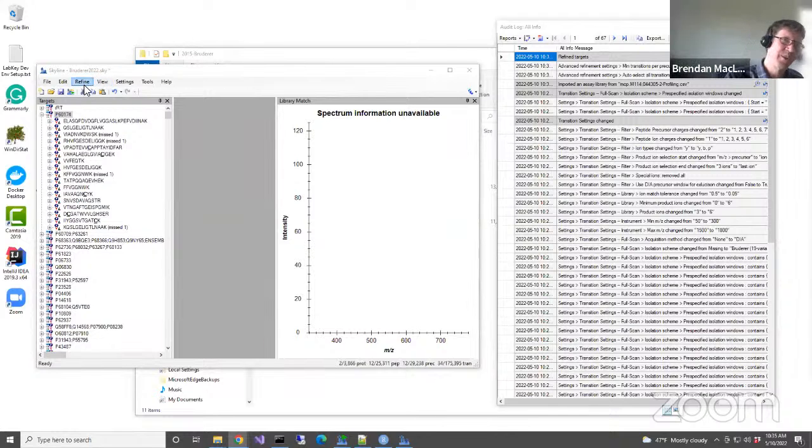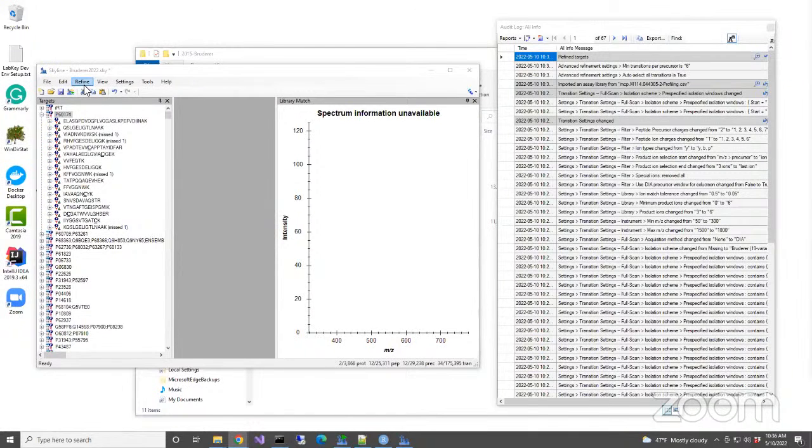Yeah, so Spectra. Hopefully tomorrow we'll go through a case where we actually build the spectral library inside Skyline. This is a case where we're going back to a paper. Ever since I started Skyline, I've been very interested in supporting both starting from scratch, doing my set of steps, and also, wow, I found this analysis in a paper, and I want to be able to analyze it with Skyline.